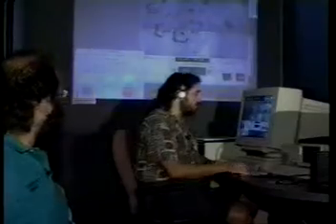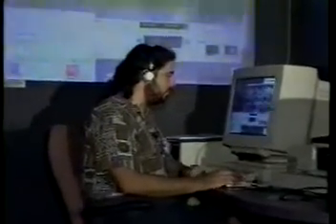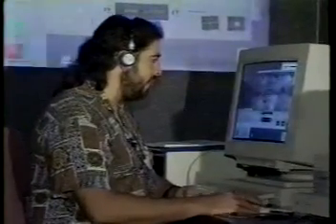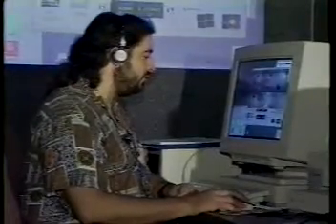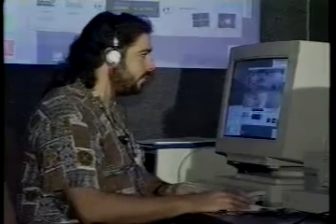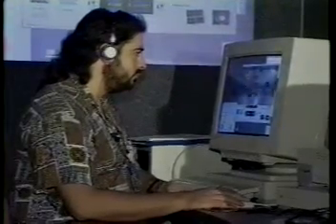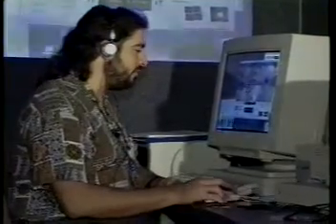Phil? Okay, San Diego, I've adjusted my reticle for 3x3 with no corners, I'm still at 5K. Let me link this position to you. Do you have the new position, San Diego? Yes, we do. Okay, I'm going to transmit the request. Okay, now this operation has been initiated.